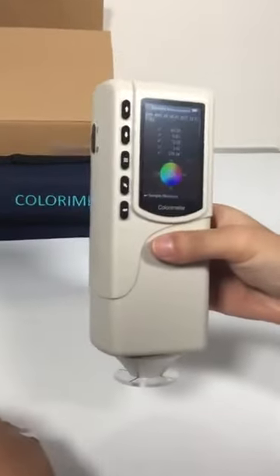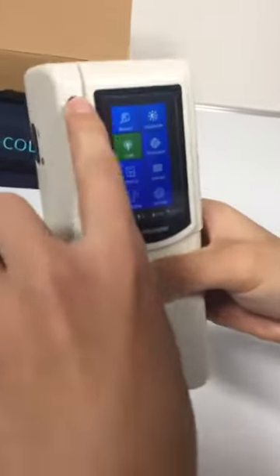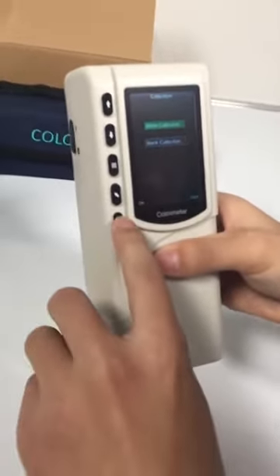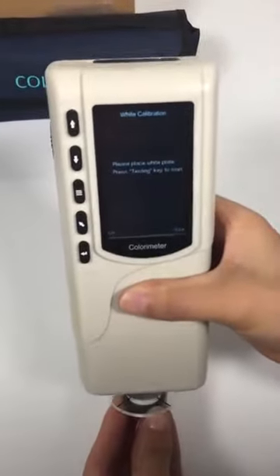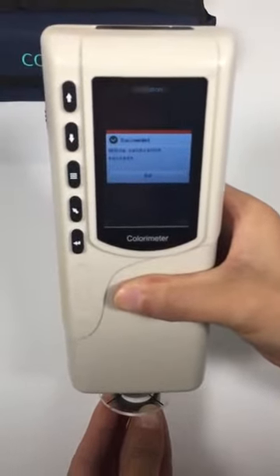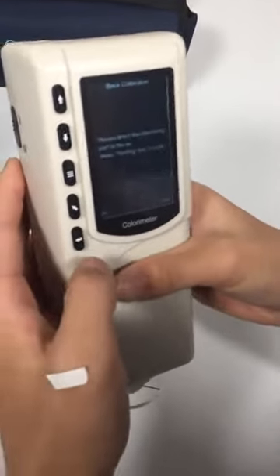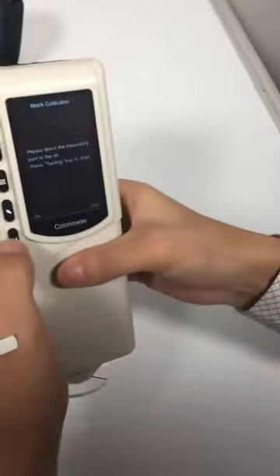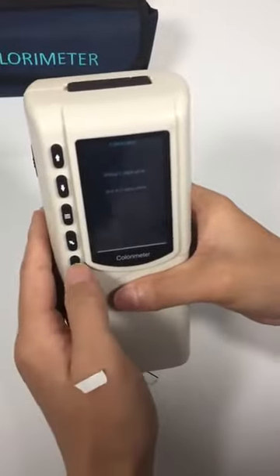First, calibration. White calibration first. And then black calibration. Do black calibration in the dark space, like under the desk. It's done. It's ready for measurement now.